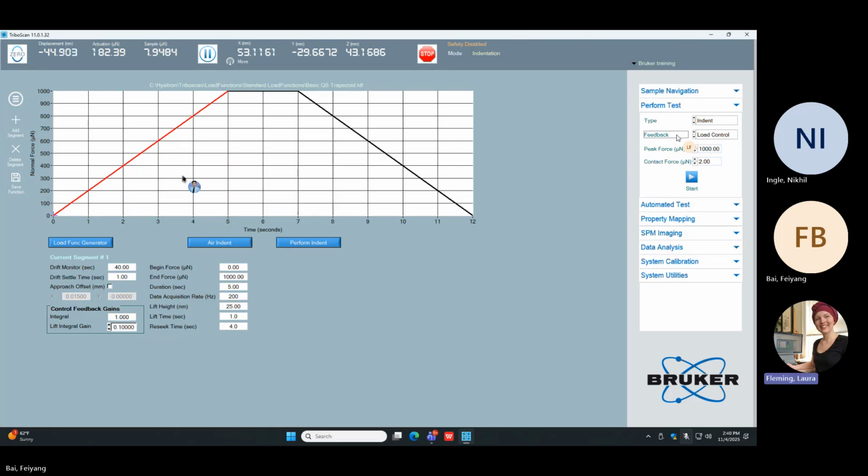And what that means is that part of that energy, instead of going fully into the sample, will go into the springs as well. Well, that happens in both cases. That's not a very good way of putting that. Let me think. What I mean is that no matter what, as you're actuating, there is some voltage, some energy going into the springs instead of into the sample. When you are in open loop, aka no feedback, it doesn't compensate for the voltage lost to the springs. Does that make sense?